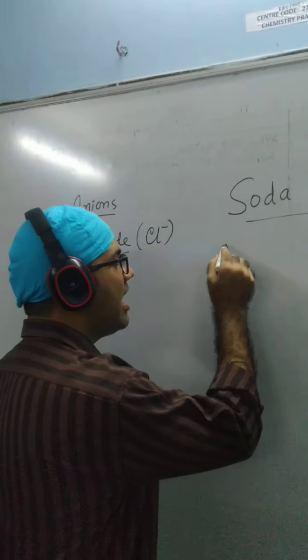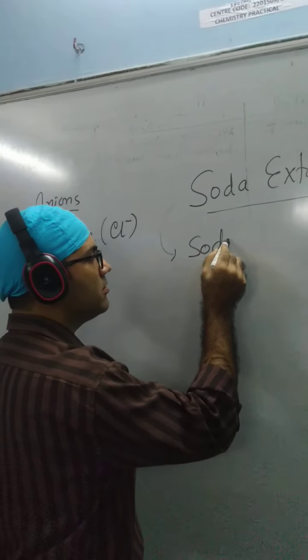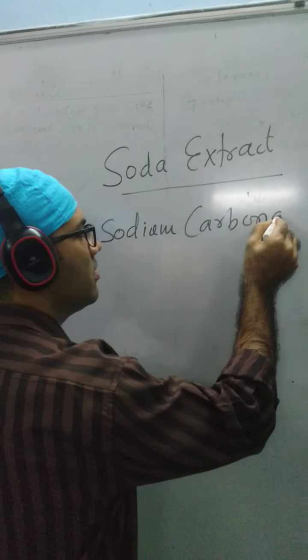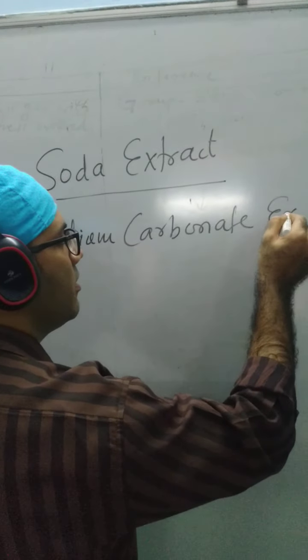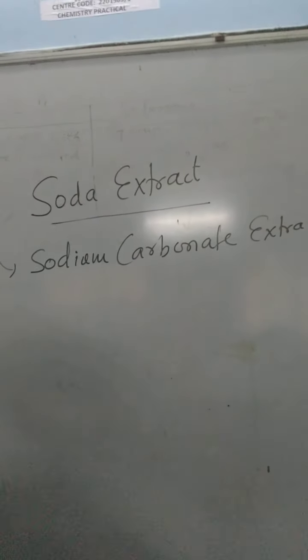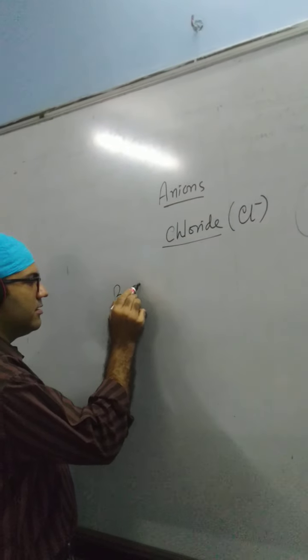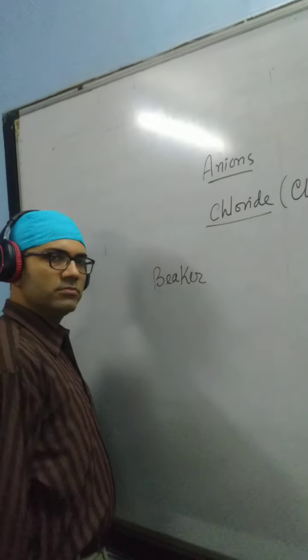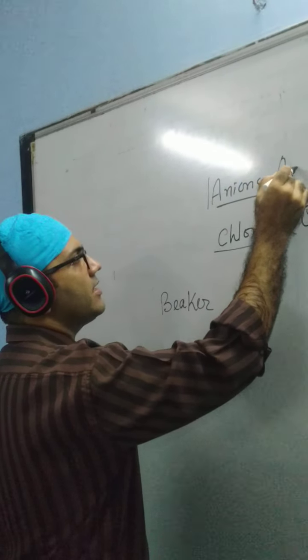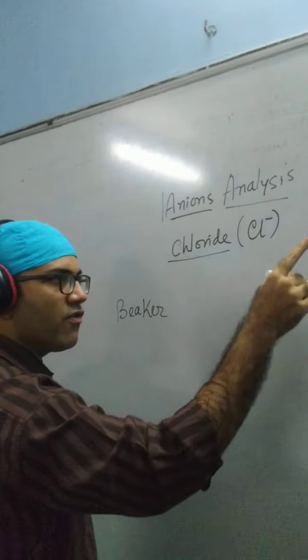What is soda extract? It is a short form. Soda extract means sodium carbonate extract. Always remember, whenever you are doing anion analysis, this is your first step.